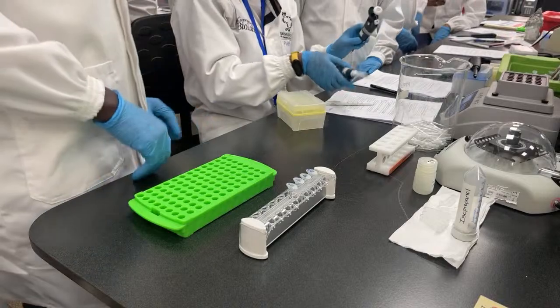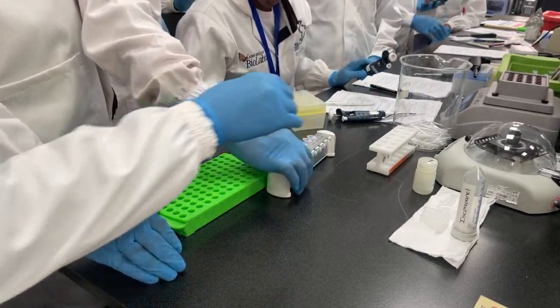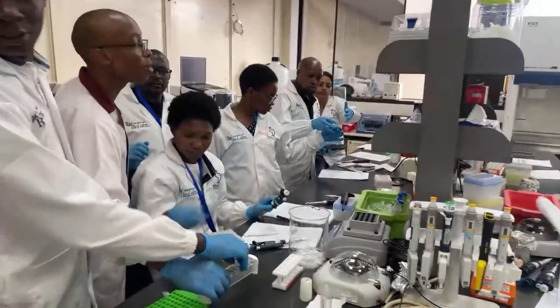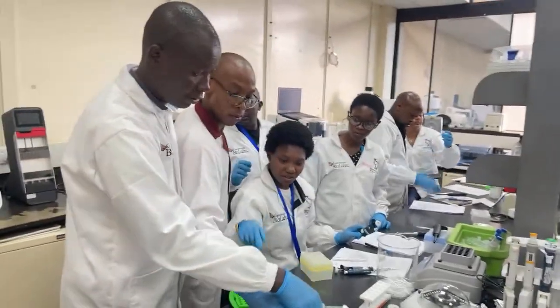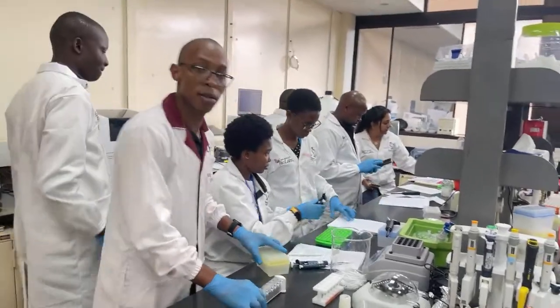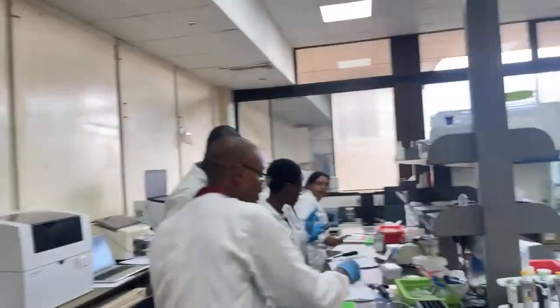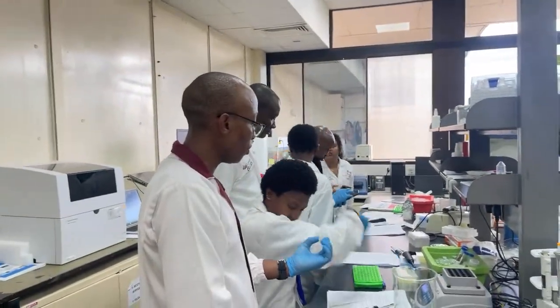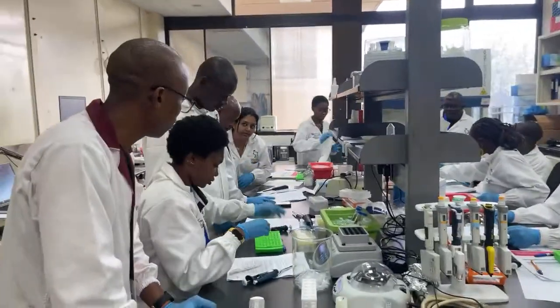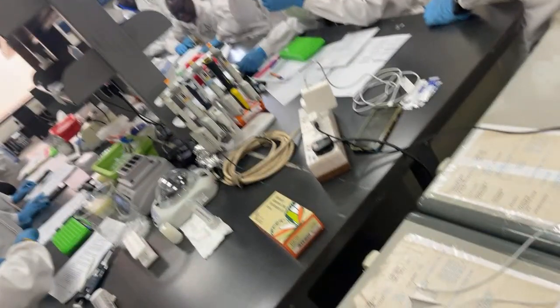Everyone must take their tube. So everyone take number two. Number three, that side. Everyone must take their sheet now. Okay, go back to the stations. And then we have the elution buffer right here. How much are we adding? 75. It's the same tube, right? Going to the nano. Add on the nano.